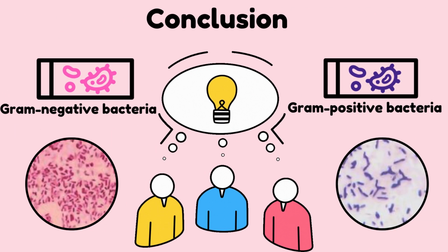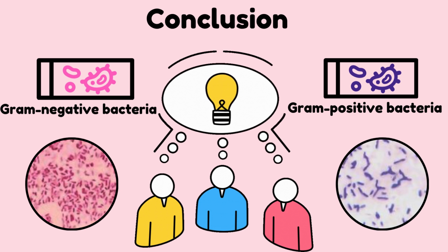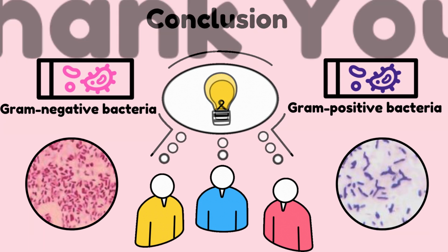Conclusion. And that wraps up our lecture on gram staining, a simple yet powerful tool in microbiology. It not only helps classify bacteria but also plays a crucial role in diagnosing infections and guiding treatment.